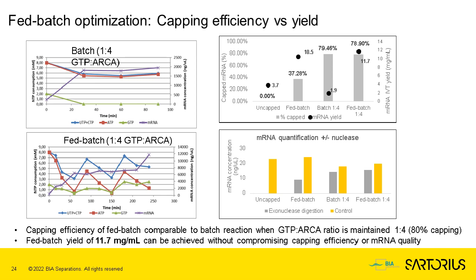So you can really design your IVT procedure based on solid analytics that gives you the concentration of mRNA, the concentration of NTPs at each time point. You can then use the terminator exonuclease to digest off any uncapped product to also read off the percent of capping of this RNA. Right. I feel like this was now a very rapid insight into optimization of IVT.